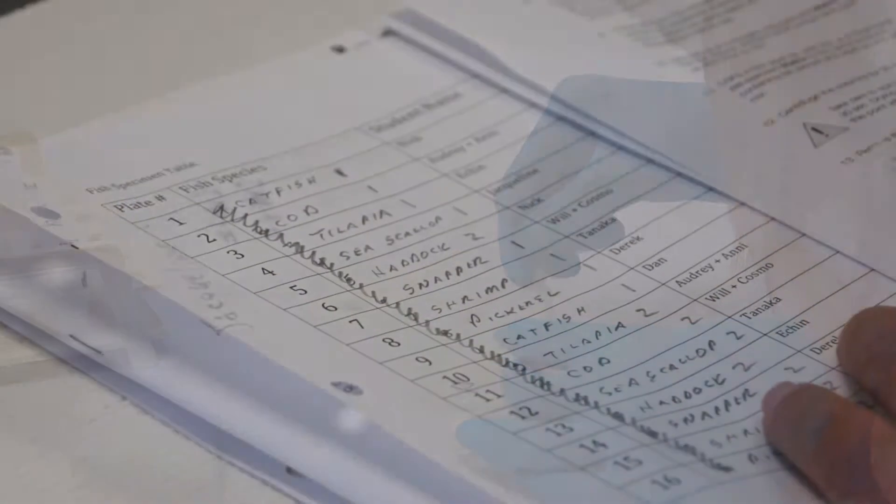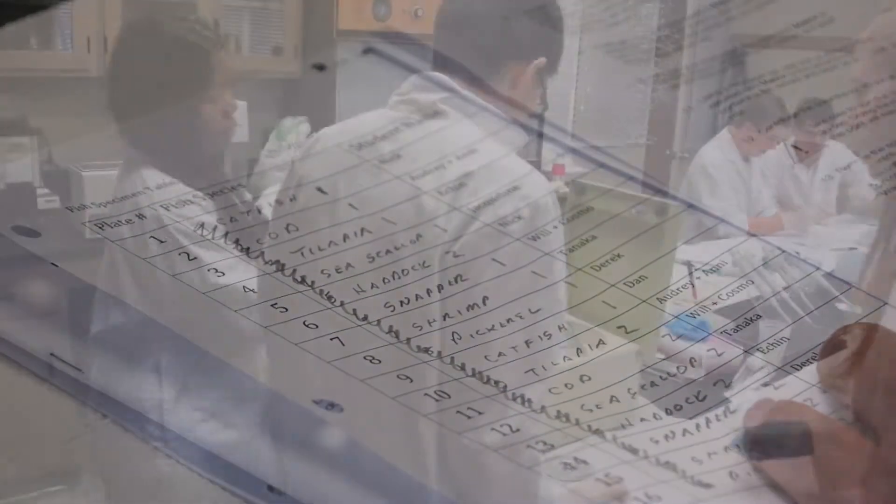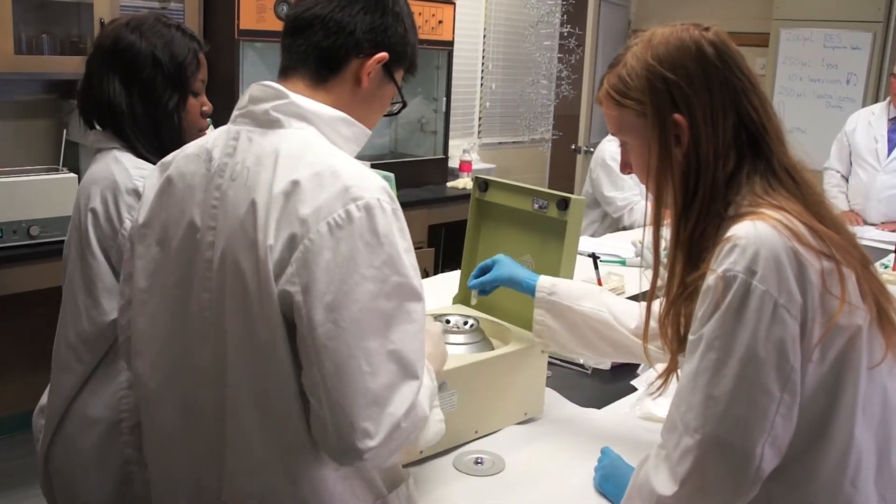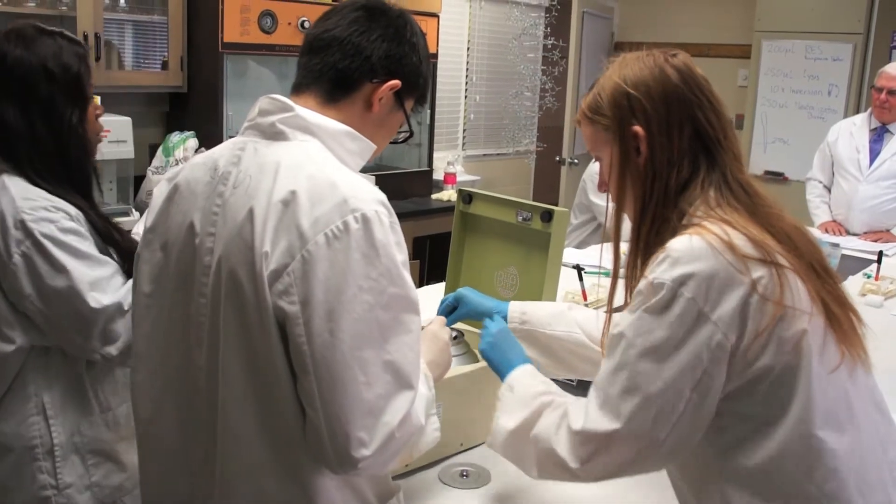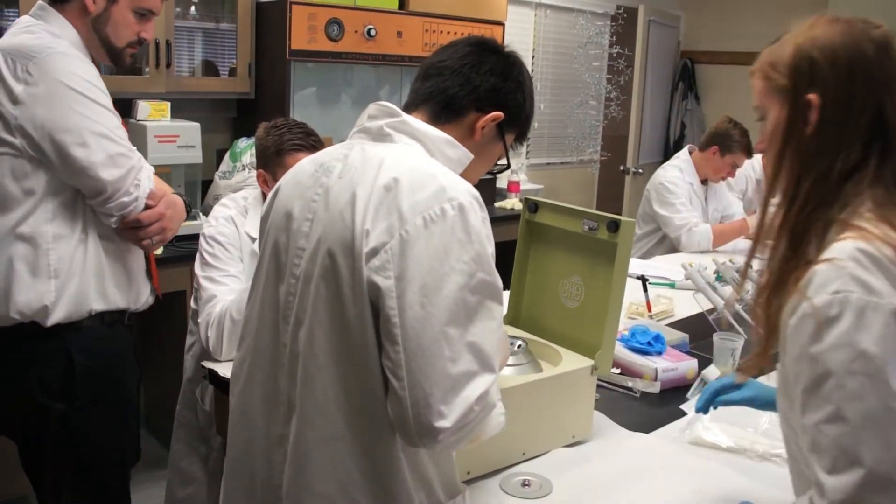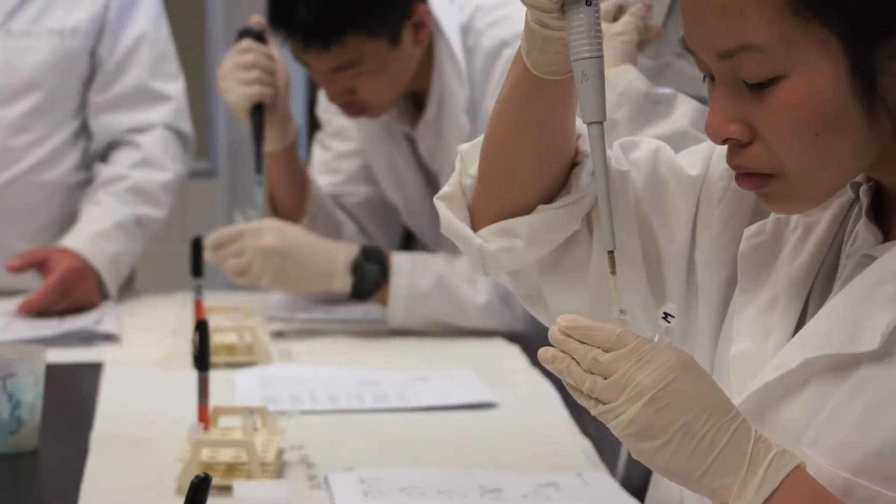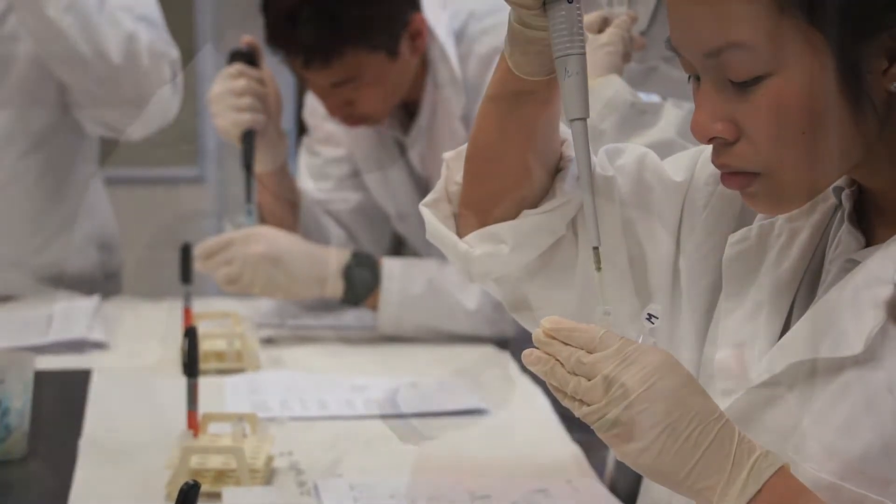So basically we were trying to isolate DNA that we were then going to send off to the University of Guelph. They look at that DNA and then respond to us and tell us what actual fish samples we had so we can see if the fish that we bought in the store was actually labeled correctly.